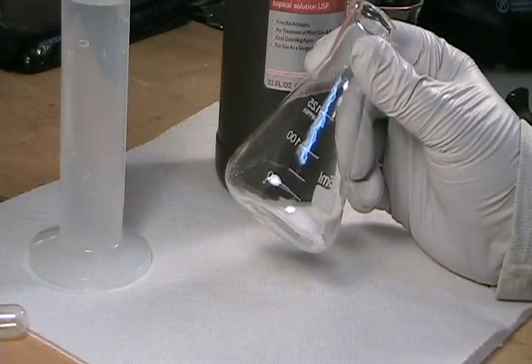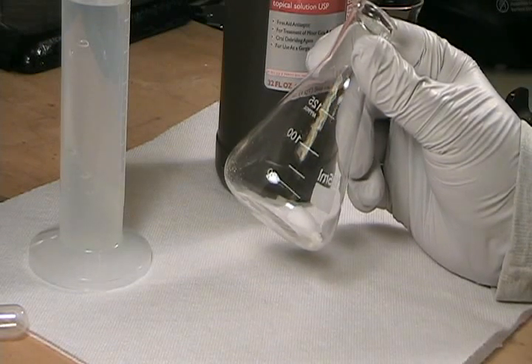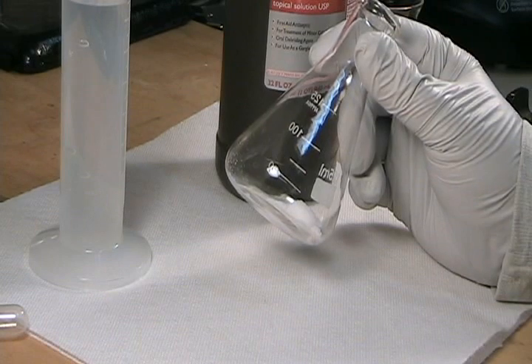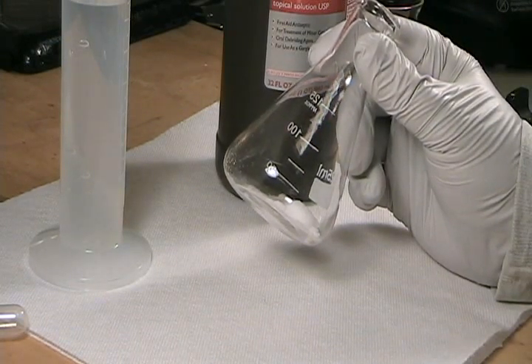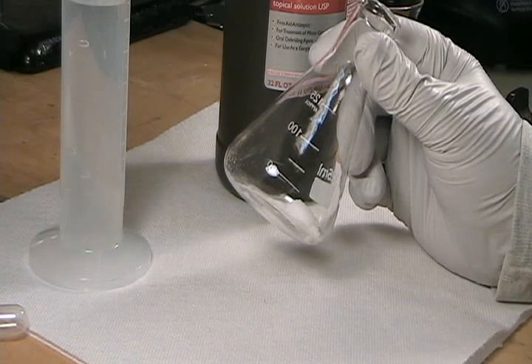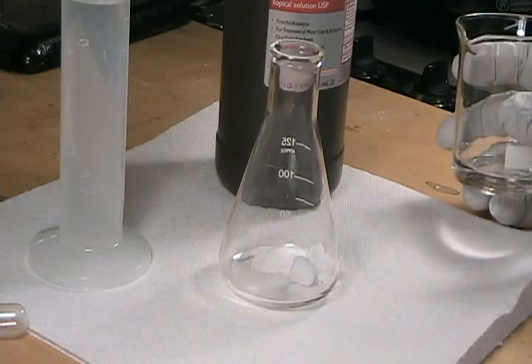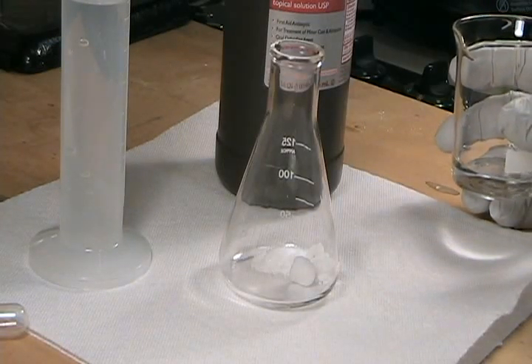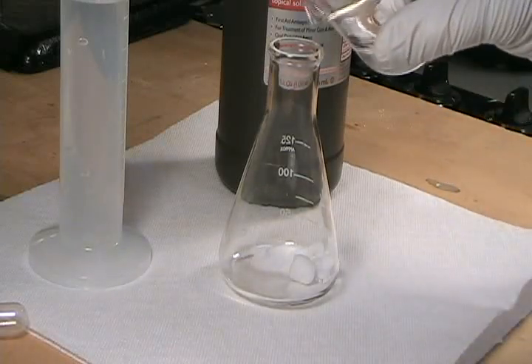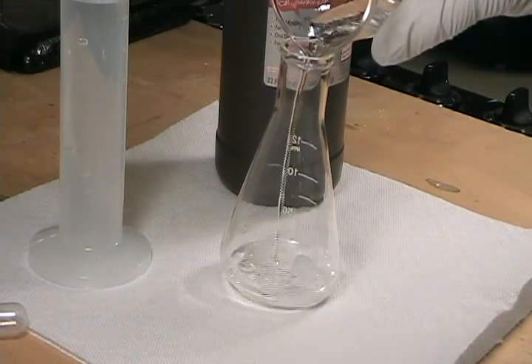The molar mass of sodium bromide is 102.894 grams per mole. I've weighed out 5.15 grams of sodium bromide, which is about 0.05 moles. Sodium bromide is 77.66% bromine and is extremely soluble in water, so I actually need only about 6 or 7 milliliters to dissolve my sample. I'm going to add more than that because excess water isn't a problem.